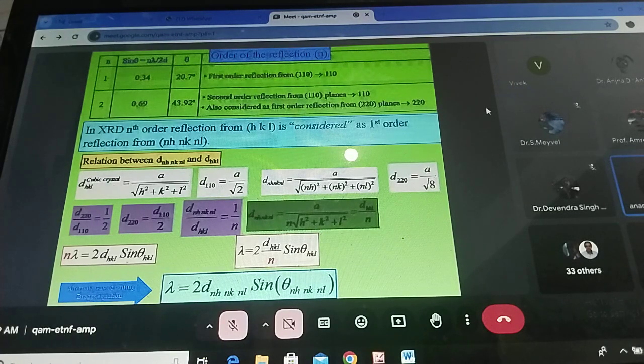No, but in graphene it is possible. In graphene it is possible, and people are making it. You can do only surface studies. I don't think you can go to the crystal level, to see that molecules are sitting like this. Okay, sir. Thank you so much. The graphene, I don't know how to crystallize it. I am just curious that if we have a monolayer-like structure of any 2D materials, can we have any information from X-ray crystallography?